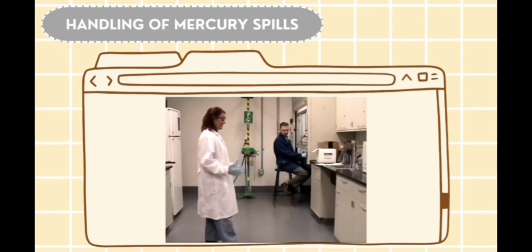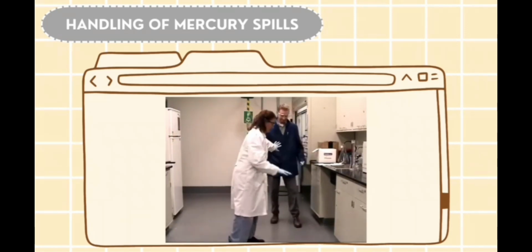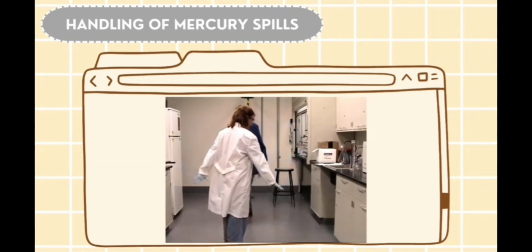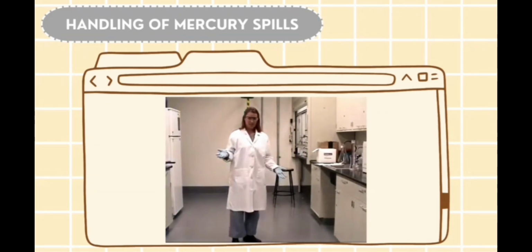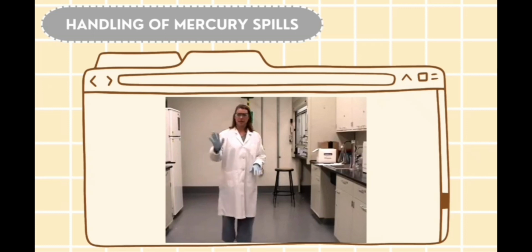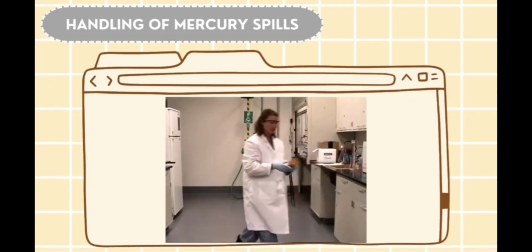Shoot! This is the second mercury thermometer I've broken this week. Tim, I need your help. No, please don't walk through there. Just if you could walk around and keep people out of the room, that would be really helpful. Okay. I saw EH&S clean this up last week. I think I can handle it, but maybe we'll have to call them, okay? Just if you could put a sign up, that would be great.